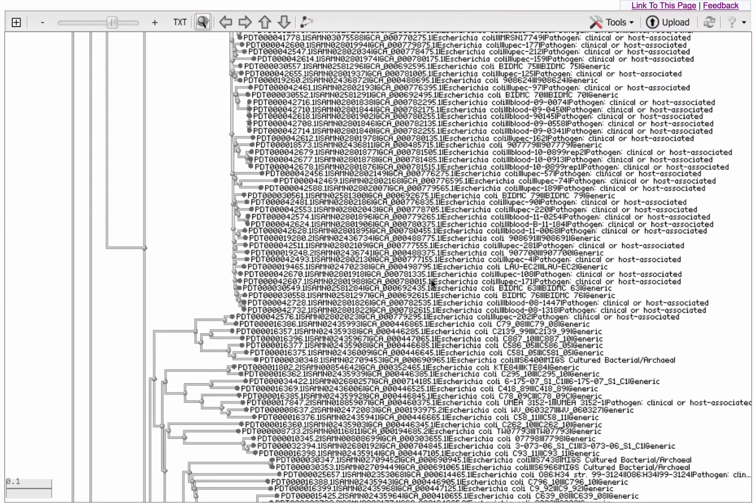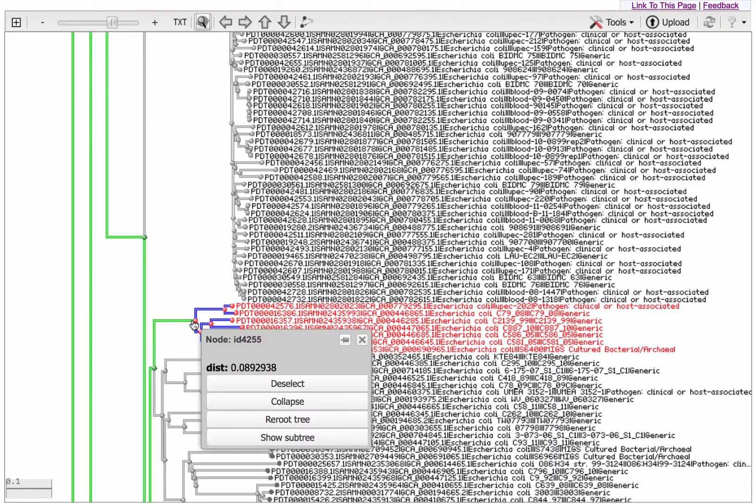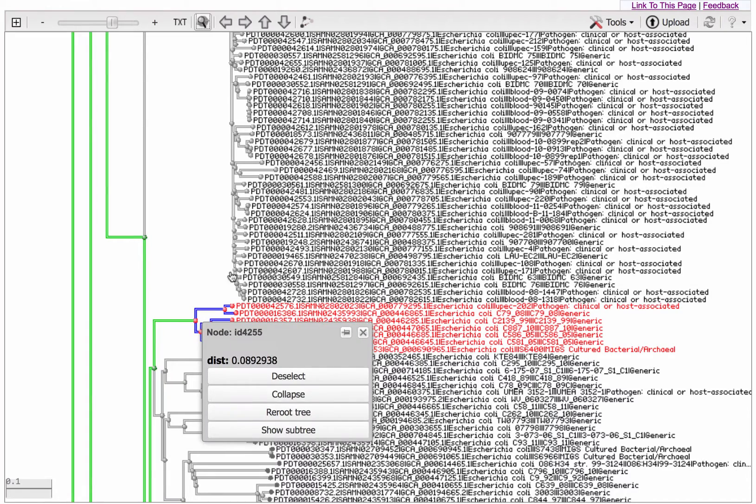To highlight a branch of interest, mouse over the node and click Select, or just click on the node.